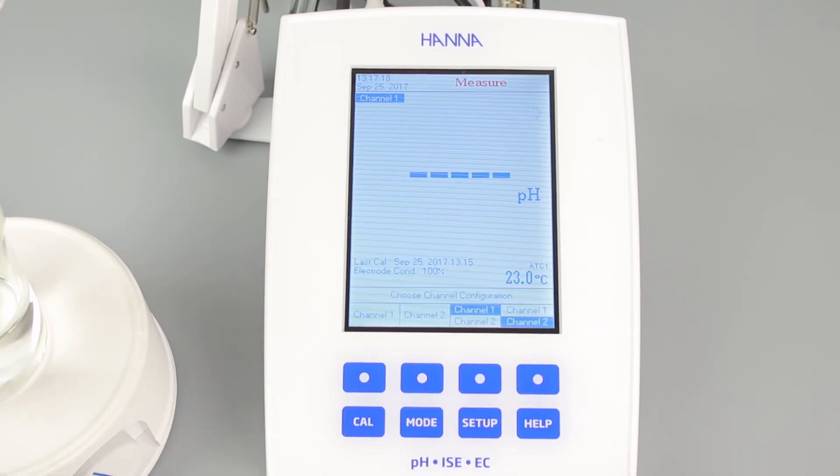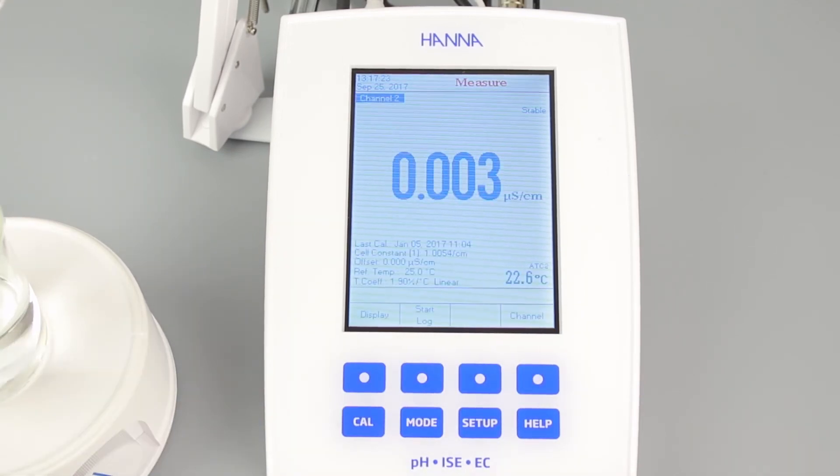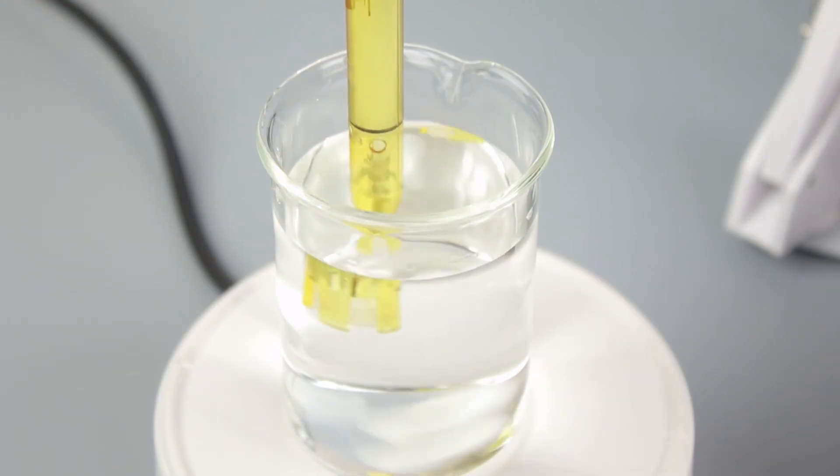To perform a conductivity calibration, access the EC channel by pressing channel, then pressing channel 2. Now press CAL to enter EC calibration mode. Submerge the EC probe in the standard of your choice. Be sure to rinse with standard before submerging the probe for best results. Once stable, press accept and then escape to save the calibration.